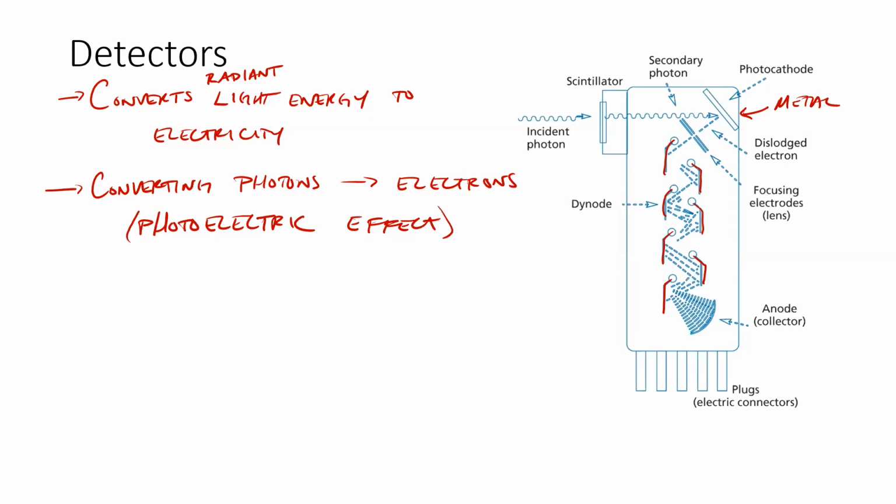So we call it sort of the electron avalanche. Because we start with a single photon and a single electron, and by the end, you know, we could have 1,000,000 electrons or something. And so we really collect a bunch of electrons at every dynode.